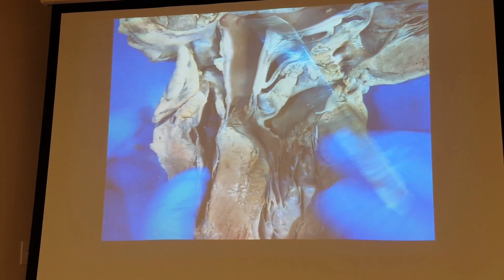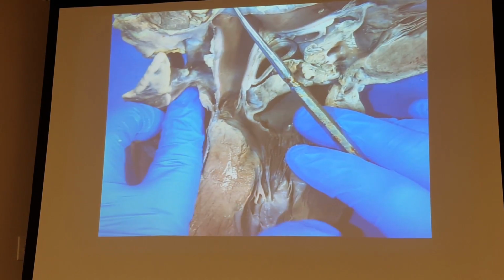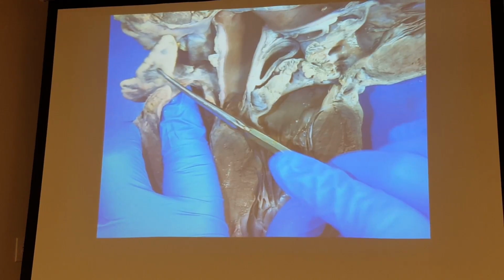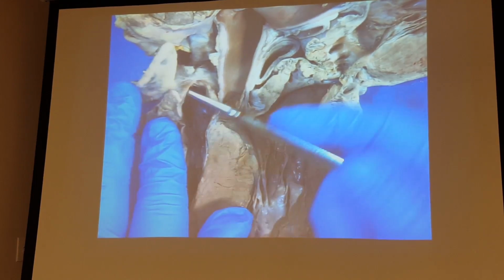Now what I really like about this cut is we always ask, what's an auricle? Well look, this is the space of the right atrium here. But then there's additional space up in the auricle. See? The auricle just hangs off there. So I can get additional space by putting blood inside that auricle.